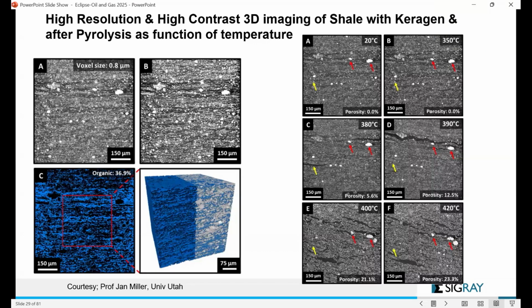Okay. Put it back, go to a higher degree, scan again. As I know, if we do a pyrolysis analysis in a geochemistry lab, we do it with a powder sample. In this case, it's a rock sample. So we will use a different type of sample in this kind of analysis.